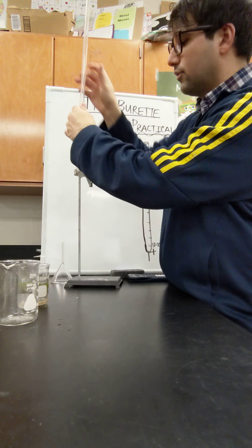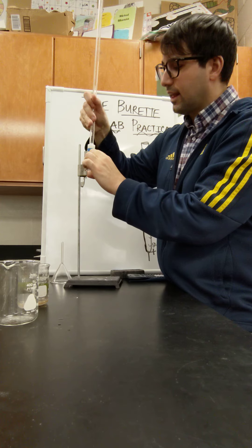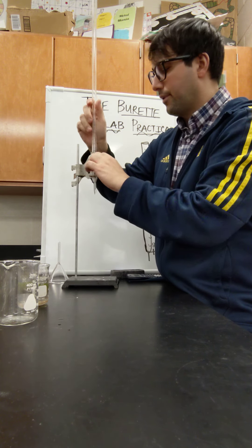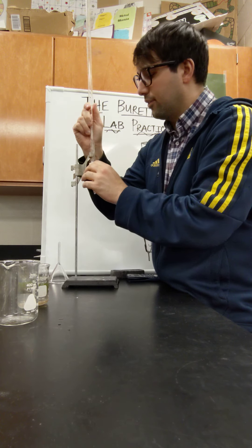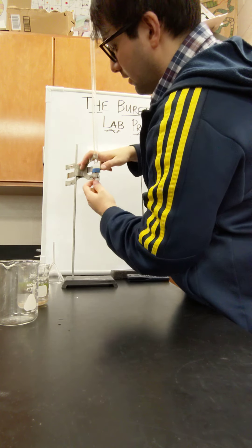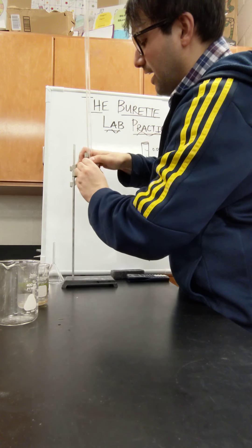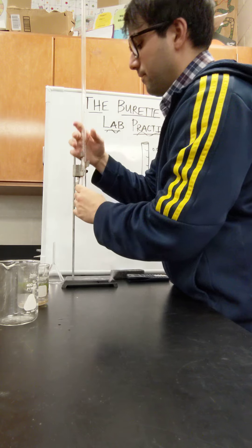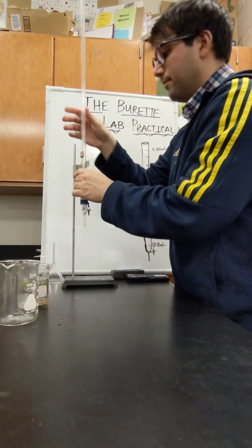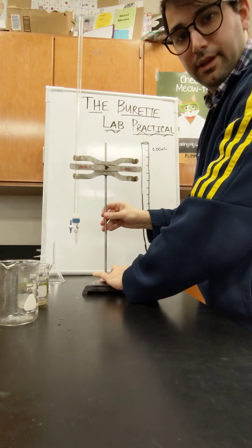I open up the middle — it's better if you have two people — and I'm going to slide this down through the burette clamp. It's going to clamp on the burette nice and tight for any experiment. Now I have my burette into the clamp.